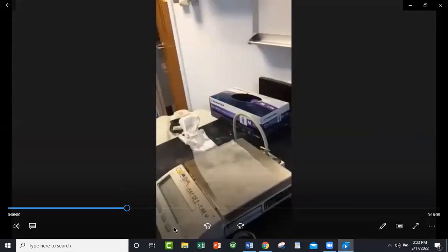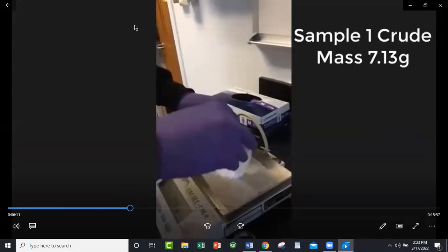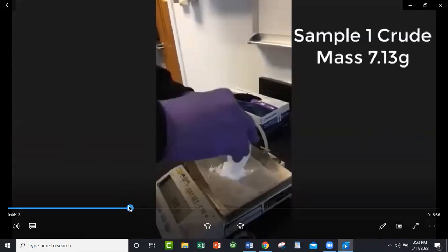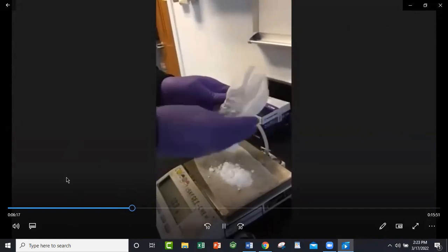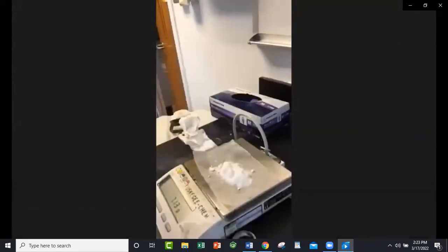Throw out my wax paper and transfer this sample to the wax paper. So that's sample one. If anybody is wondering, first sample. Sample one, if you want to take that one, the crude mass is 7.13 grams. And if anybody is wondering at this stage of this aspirin, no, you cannot ingest it. It'll make you real sick.